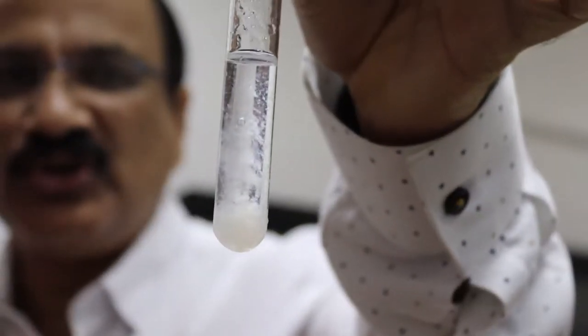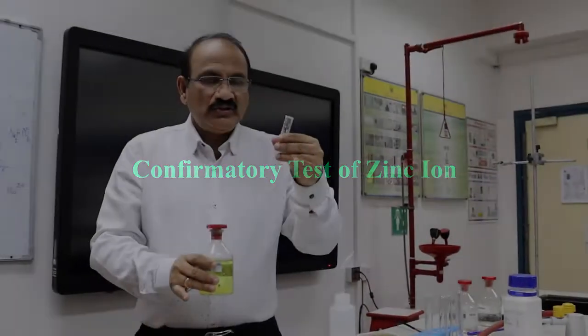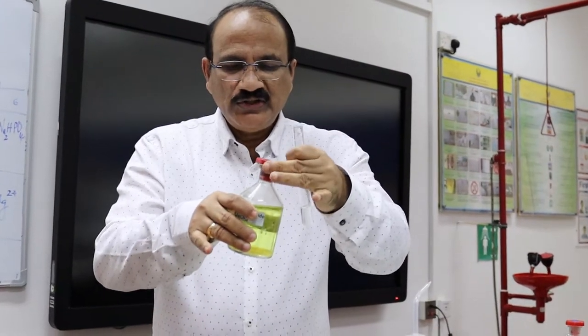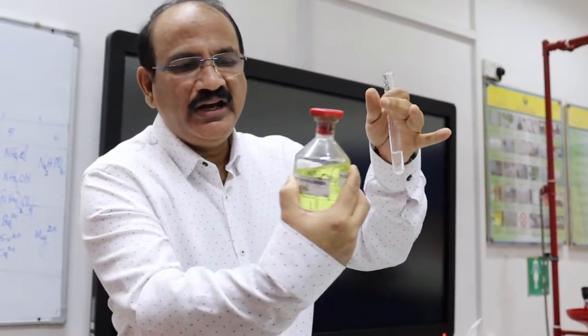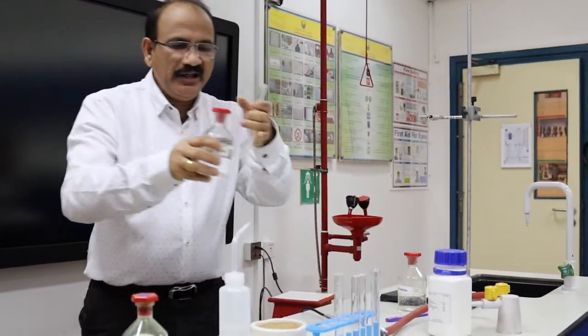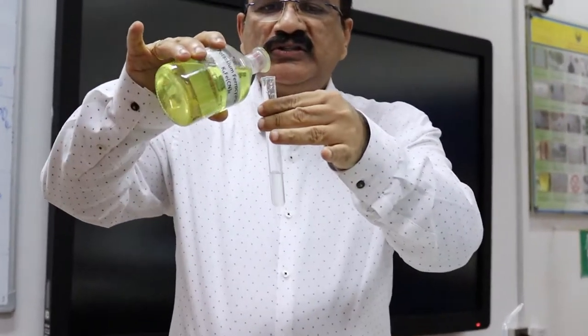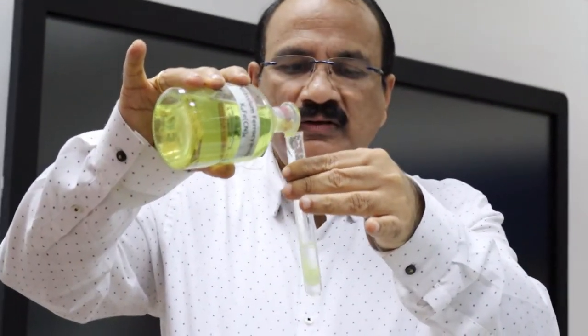This white precipitate shows the presence of Zn2+. For the confirmatory test, we need the salt solution and potassium ferrocyanide. We make it into an acid medium by adding dilute HCl, followed by potassium ferrocyanide. When we add potassium ferrocyanide, we get a precipitate — this is the confirmatory test for Zn2+.